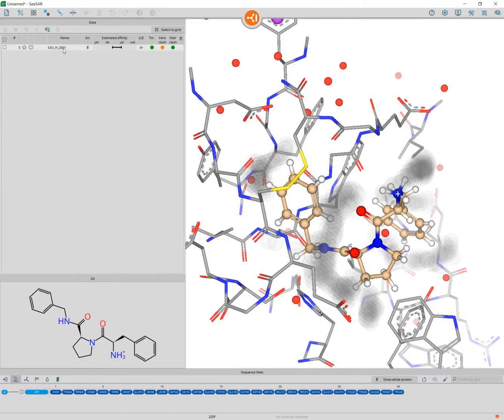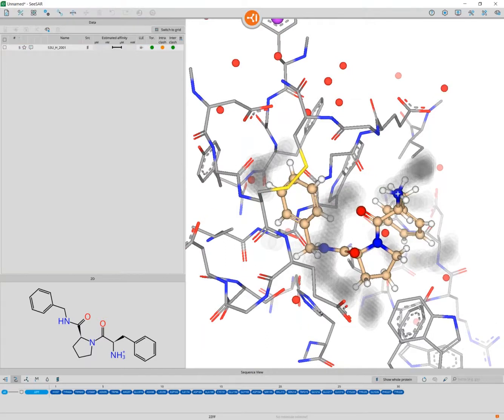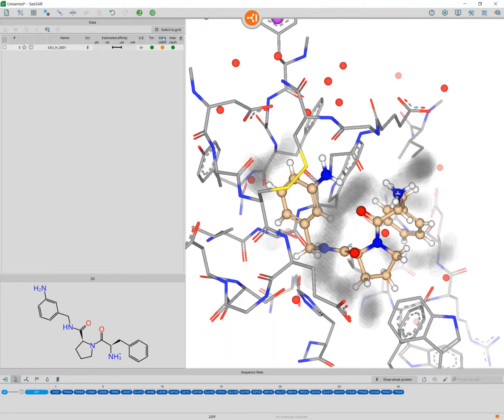If you want to get the coronas back, just to remind you where there were good and bad areas on the binding site, you see I can click on the table again, my coronas will be there, but my editor icons will be locked. So to start the editing, I press the resume button again. And so we had this red corona here, and we've been in a very hydrophilic environment. So what I'm going to do first is shield this carbon by adding an amino function.